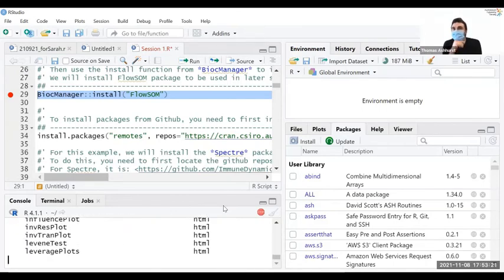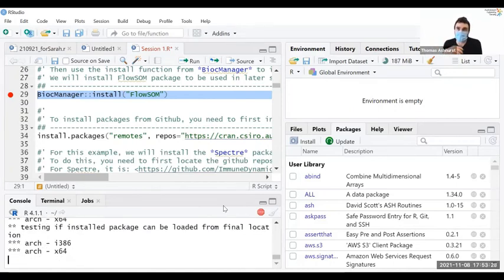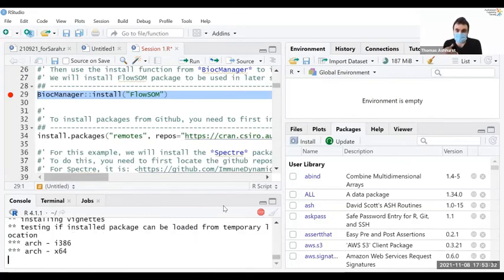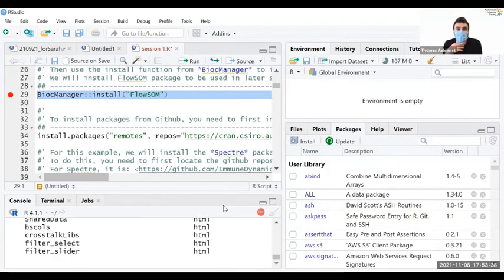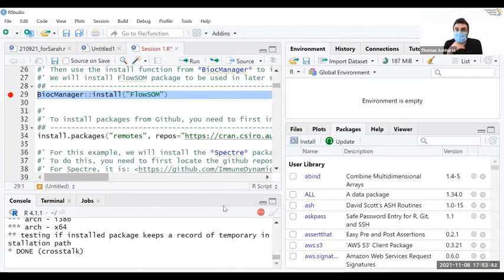The nice thing though, of course, is even if R quit or crashed, the nice thing with the code structure is because it's by definition reproducible, even if your computer crashed right now and you got back to it, you could just run the same code and you would get the same result. Okay, yeah, good to know that. Thanks.